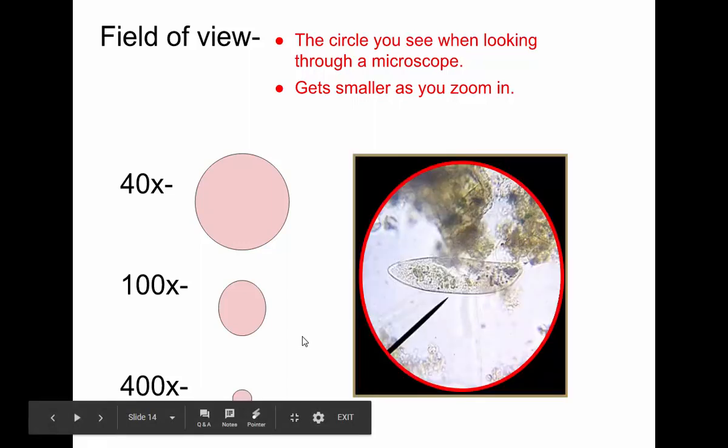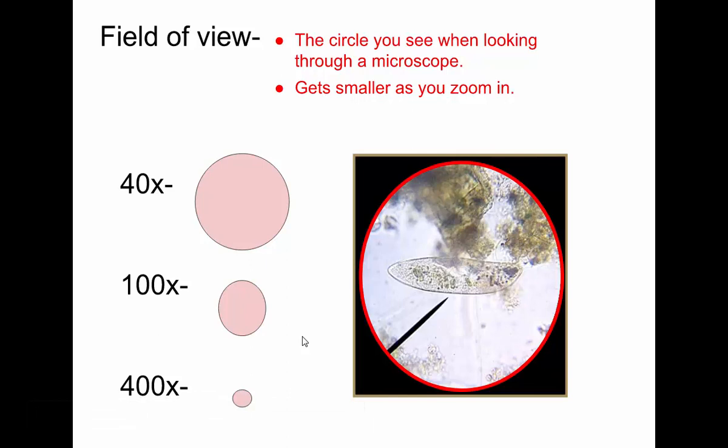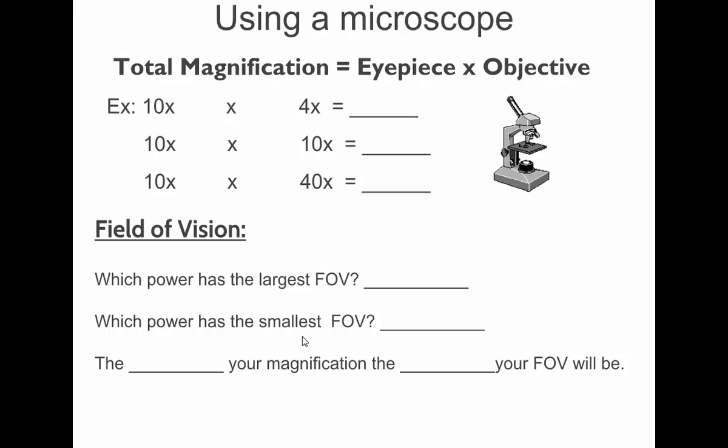This picture sort of represents that. Here's a paramecium. Under low power, this is what I would see, all of it. Here you can see the pointer. If I switch to medium power and zoom in, I'm only going to see about that much of this object. And then if I switch to high power, I'd only see this one. As we increase our magnification, we decrease our field of view.